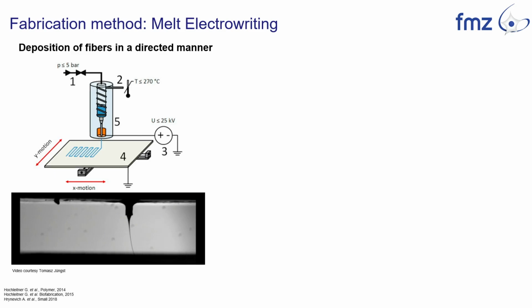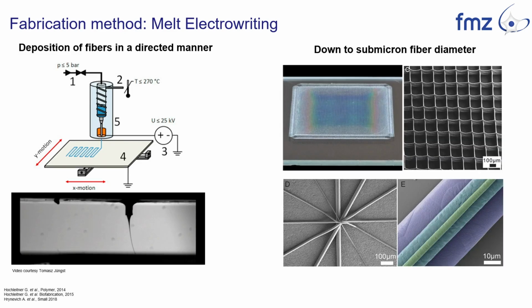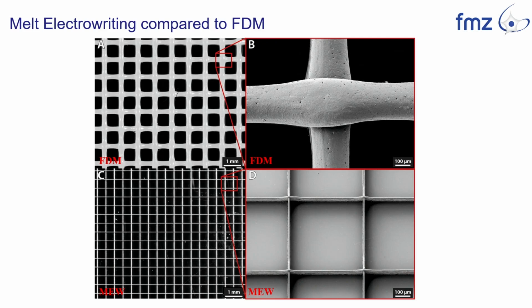Melt electrowriting is basically 3D printing, except that there is a distance between the nozzle where the polymer is extruded and the collector plate, and by the addition of an electrical field, the fiber is drawn and elongated. With this technology you can basically print fibers which are down to 1 micrometer thick, and create different kinds of scaffolds. In direct comparison to conventional FDM printing or 3D printing, you can see that the fibers are much smaller in this case.